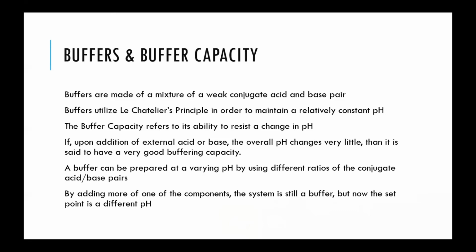These buffers are incredibly important in many types of biochemical or biochemistry settings where different enzymes, different proteins and things only work at a very, very specific pH.